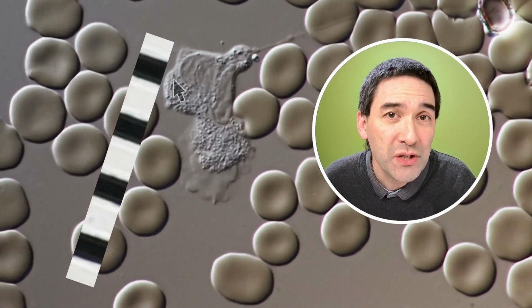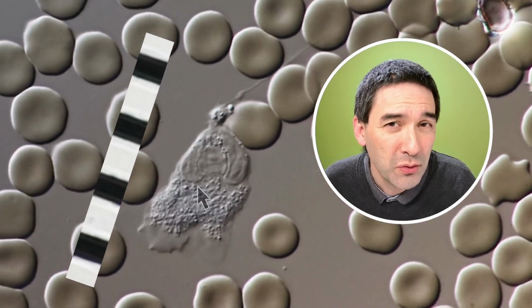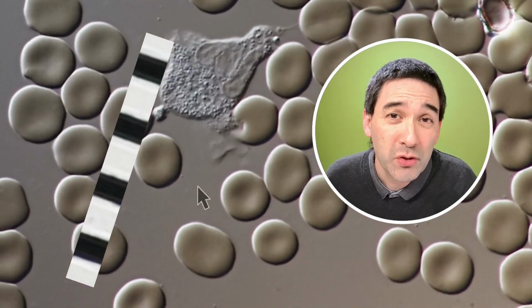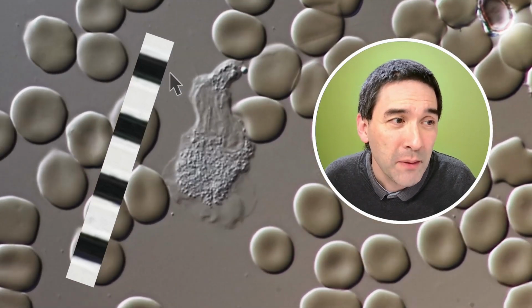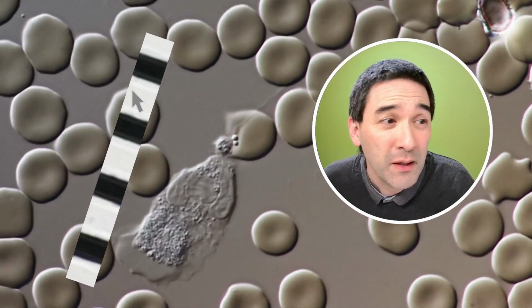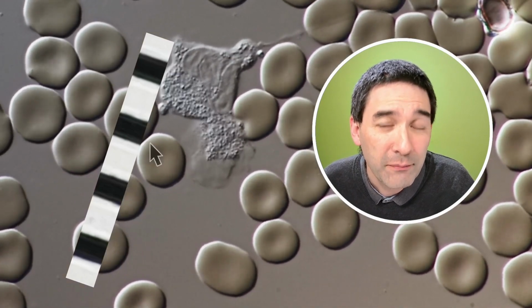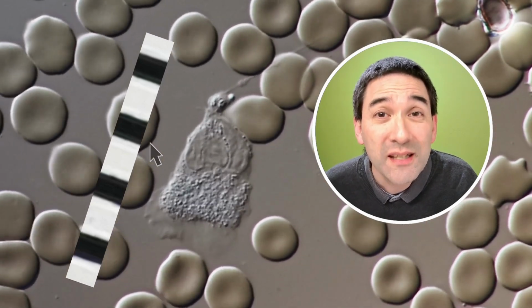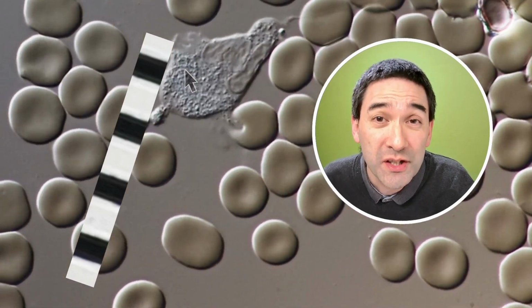And so now you see this white blood cell move along. Of course, I have to measure the speed using its original speed. So this means that I have to take the length of the original video clip. What we see over here from black line to black line is 10 micrometers. Over the course of this distance here, it's 25 micrometers, and the original time of the clip is 131 seconds. So right now it's of course much faster, but the original speed is just a little bit over 2 minutes.